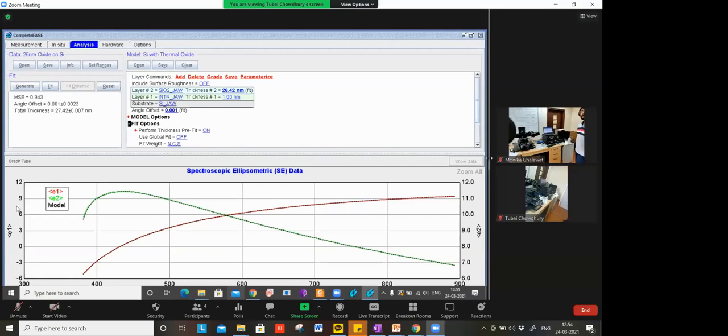Hello. So anyone has any questions? Actually, I want to ask you that the data you are taking here, that is experimental, okay? No, no, no. It is not from our instrument. Actually, it is reported in that software. It's some example data. Actually, we don't use this software to take the experiment to observe the experimental data. It's a database from the competitive software actually.